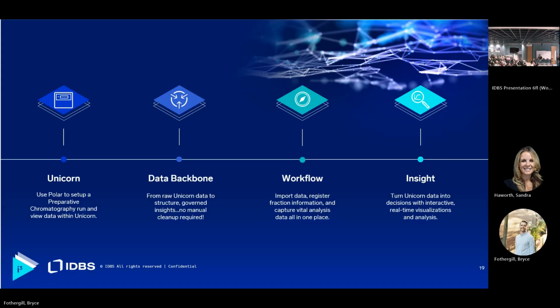I was referring to the data source. If there is a connection with a database kind of solution, it means that we can see a different kind of data source, instead of ingesting data in IDBS multiple times. Avoid multiple ingestion of the same kind of raw data.